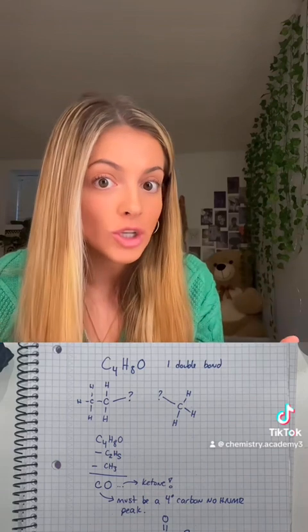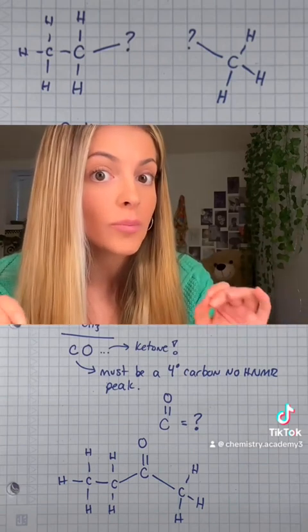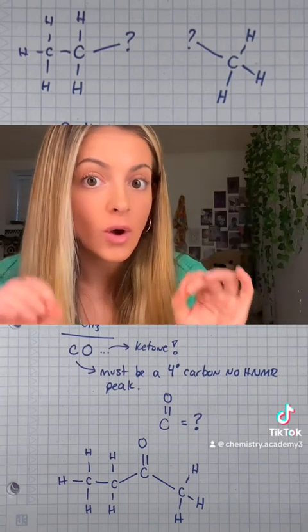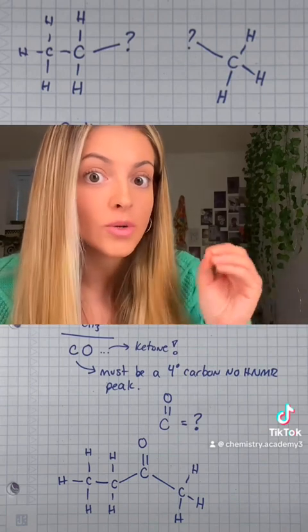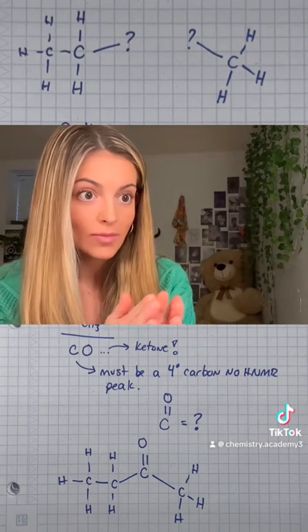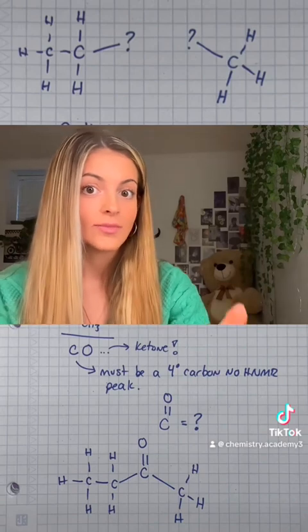What is it connected to? Well, what did we not have? We knew the CH2 had an extra group, because all carbons like 4 bonds, that it must be attached to. The CH3 group that was electron poor also needed 1 more bond, so put that as a question mark. So this final group is the question mark. It's a C double bond to an O, so you just put that in place of the question mark. And you attach the CH2-CH3 group to the question mark, and you attach the CH3 group to the question mark. Hence, you get your structure. That's it, that's all. Hopefully this helps.